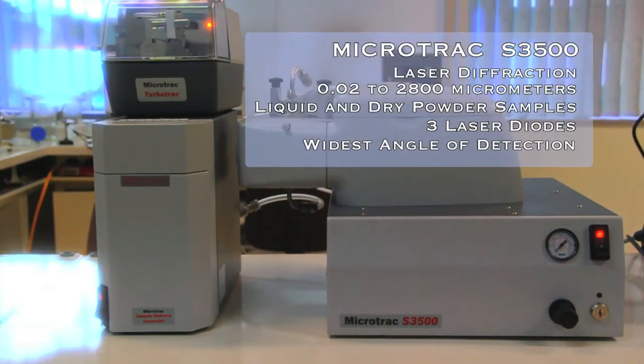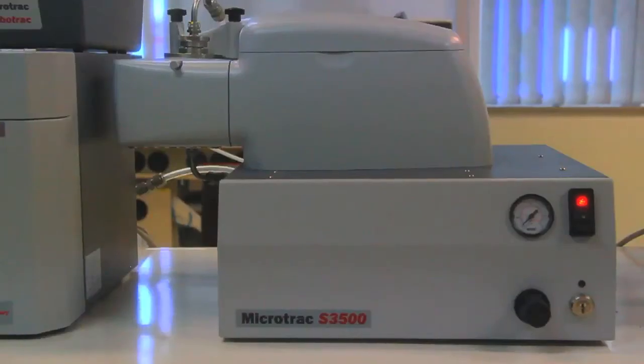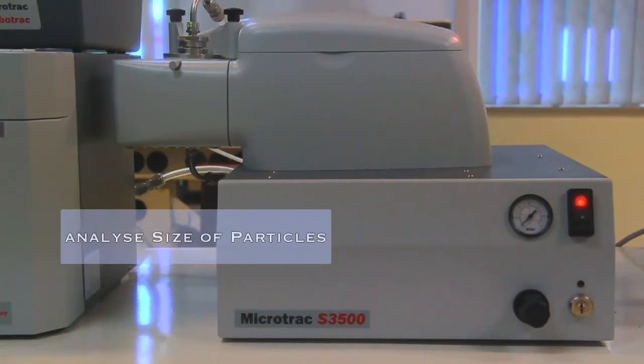The complete system consists of the S3500, the Sample Delivery Controller, and the Turbotrack. The S3500 houses the laser diodes and other optical components.